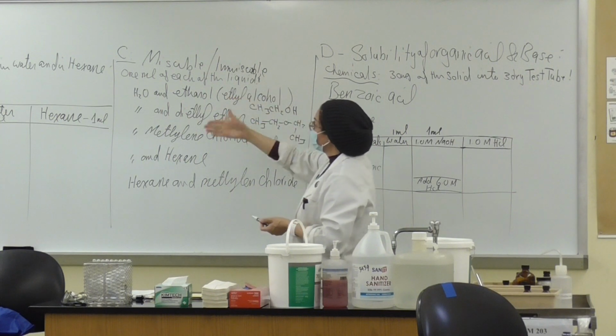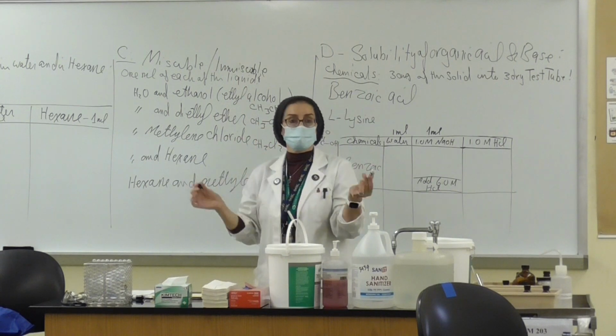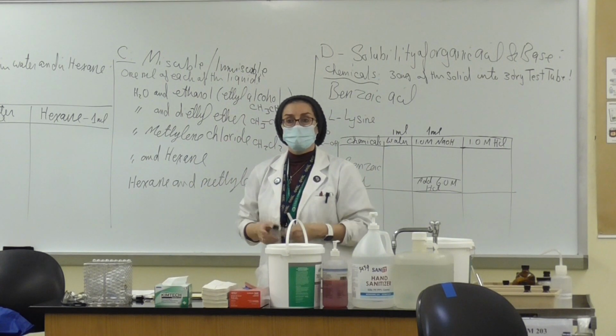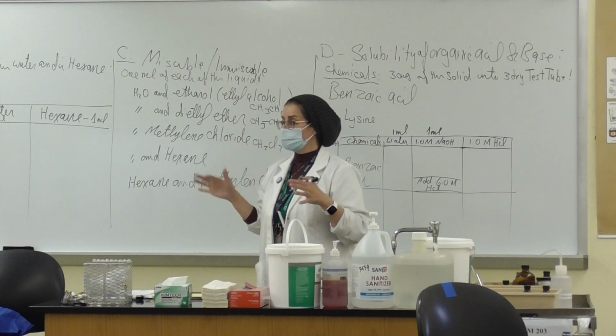Each one of them, again, if you look at it, I believe each one of them will need 1 milliliter, and then you mix them together, okay? Is that clear? Do you have a question about these?